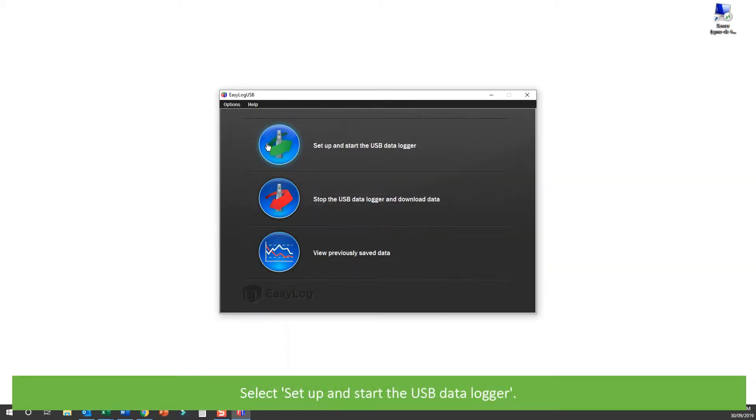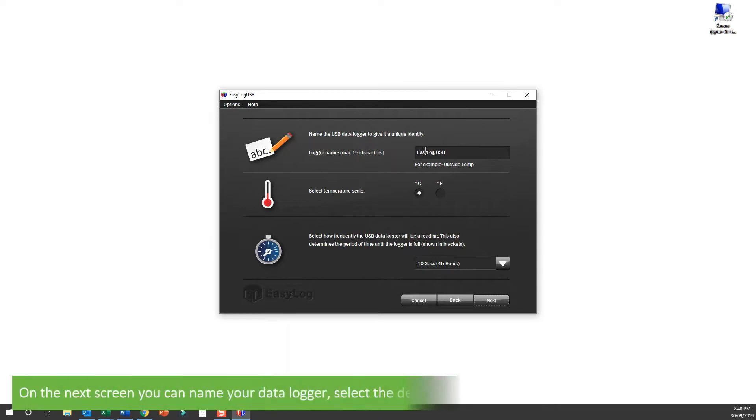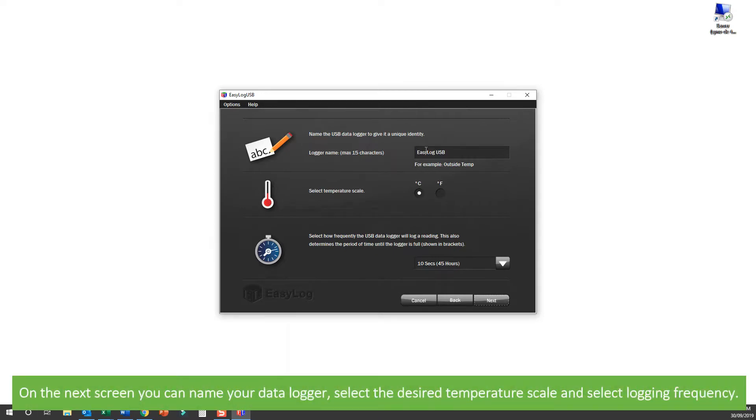Plug in your Datalogger and select 'Set up and start the USB Datalogger'. On the next screen you can name your Datalogger, select the desired temperature scale, and select logging frequency. Note: when selecting the interval, the time displayed in brackets is the time it would take for the logger memory to become full.